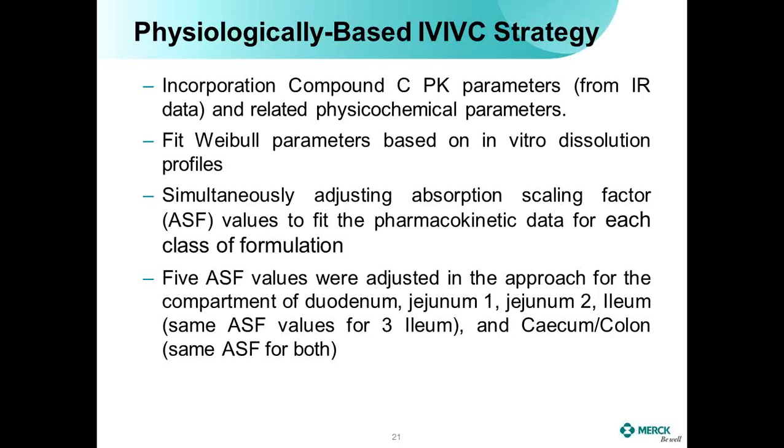So overall, that's the physiologically-based IVIVC modeling strategy. First of all, we incorporate compound C's PK parameters and also the related physicochemical parameters, the drug information. Because we are trying to model the controlled release formulation, we have to get input from those controlled release formulations. So we're using the GastroPlus Weibull function to fit the individual dissolution profiles and use the Weibull function profile as the input for those controlled release formulations.